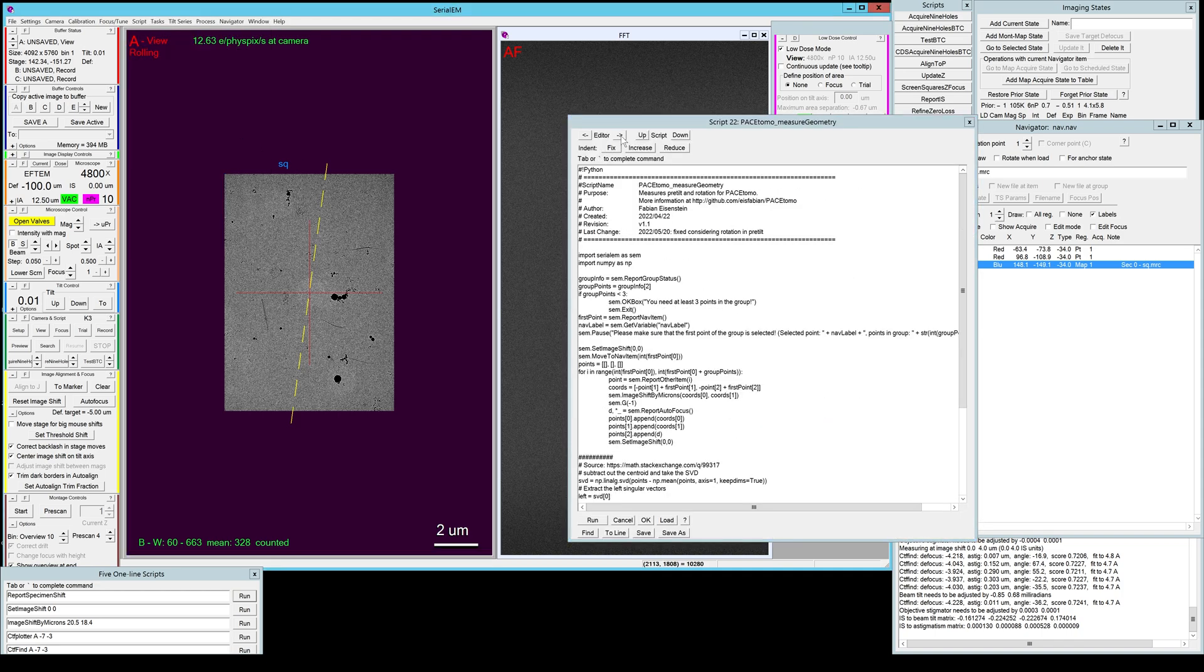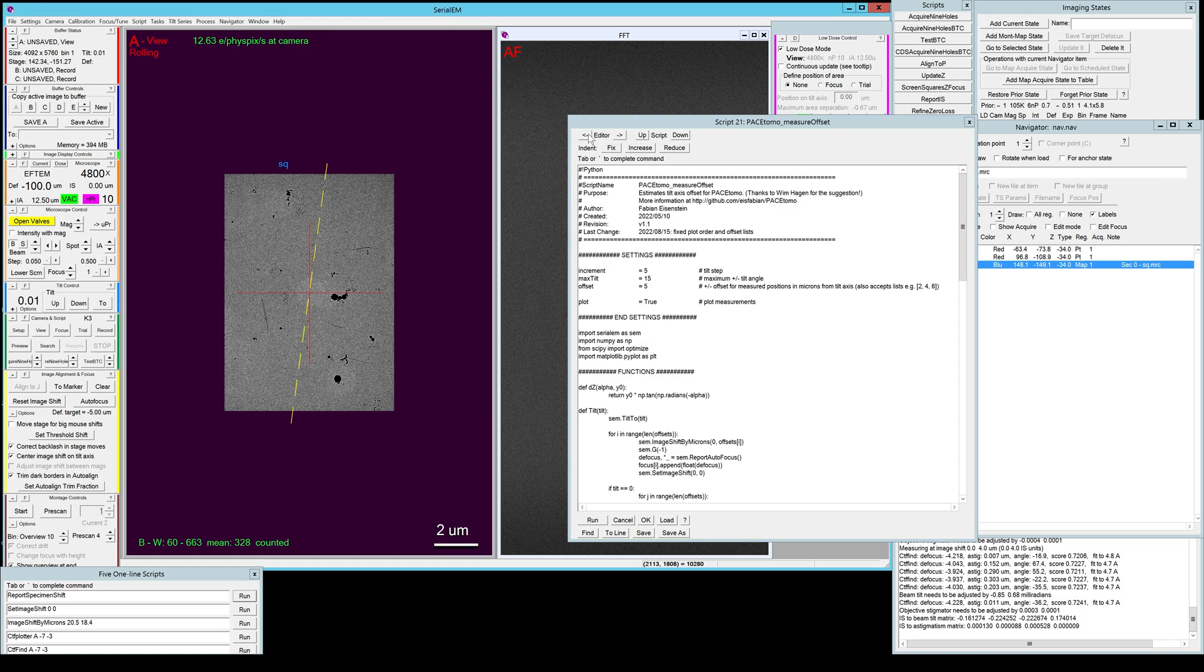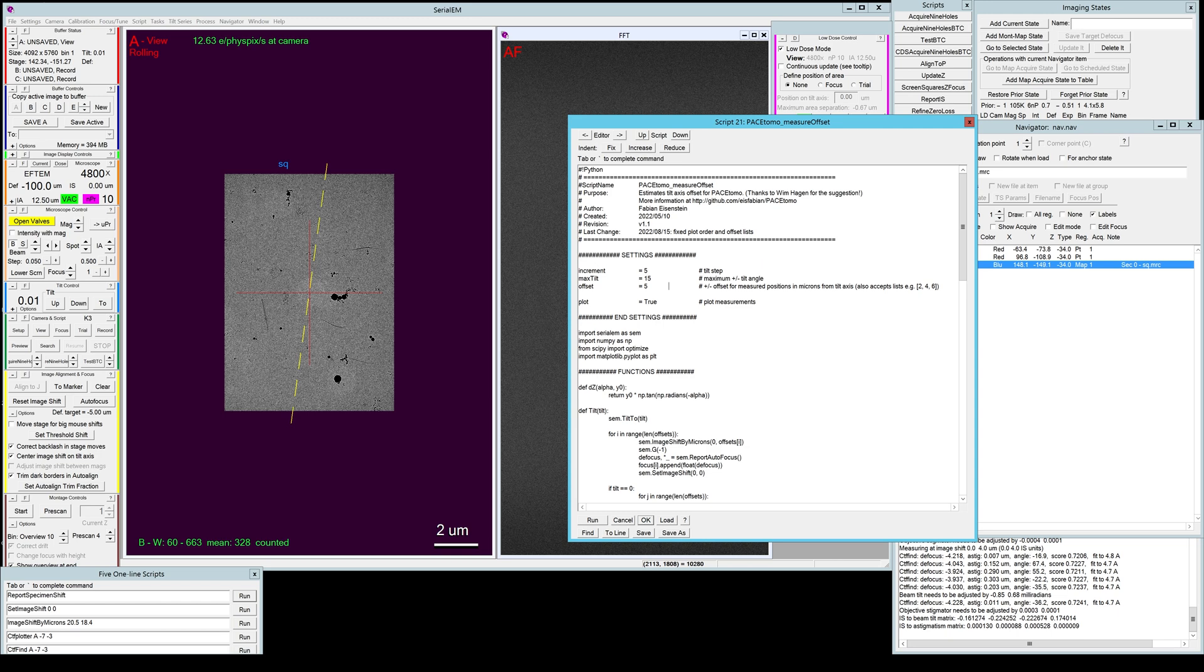For this purpose I provide a custom script calculating the tilt axis offset in particular to optimize Z. I already copied it into the SerialEM script editor here. It's called the PaceTomo_MeasureOffset script and the default variables work usually quite well, so I can just run it like this.